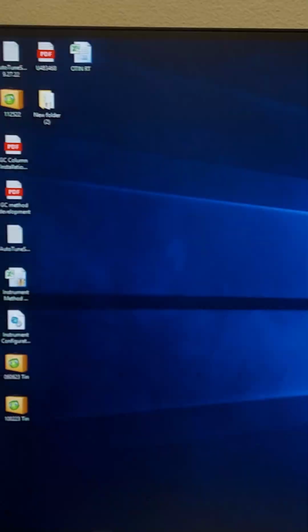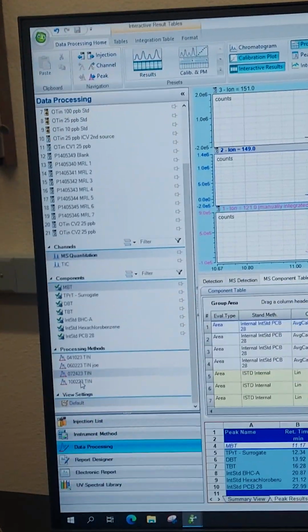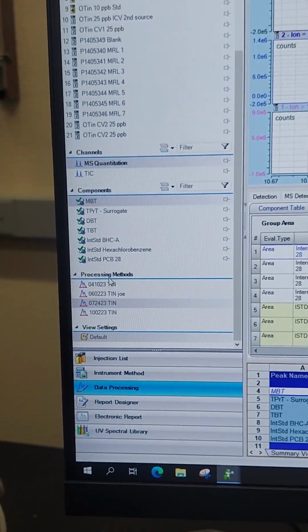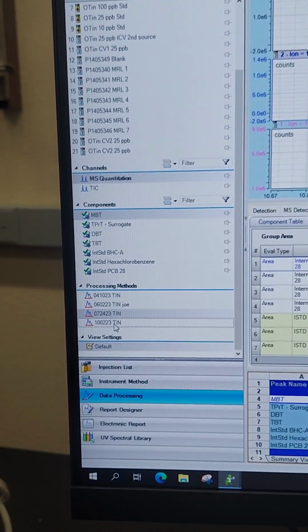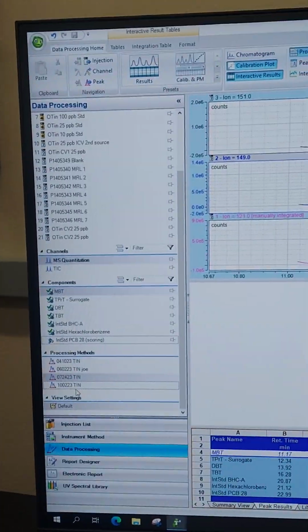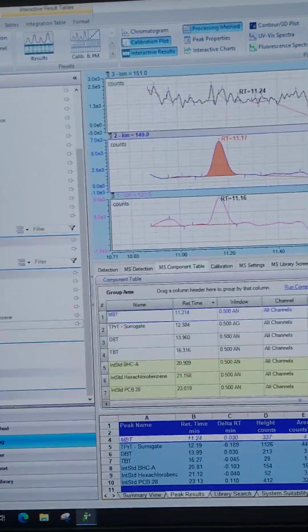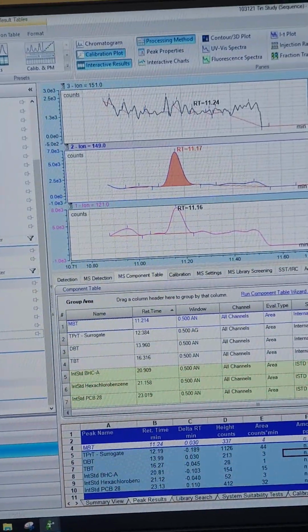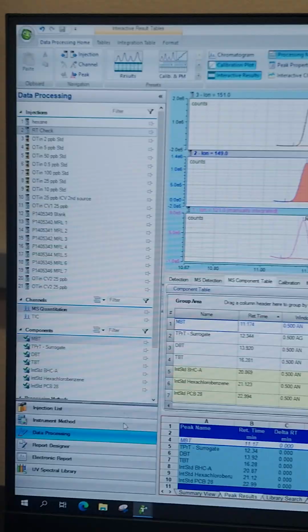And then if that's wrong, we'll see later. We can click here, and then it'll use one of those other processing methods. So if I click this one, it'll use that processing method for all these, and you'll see all now is different. Things don't confirm, and all those have the question mark there. Yeah, exactly.